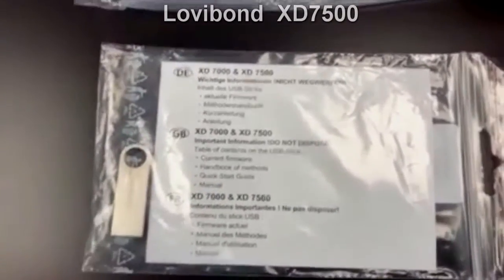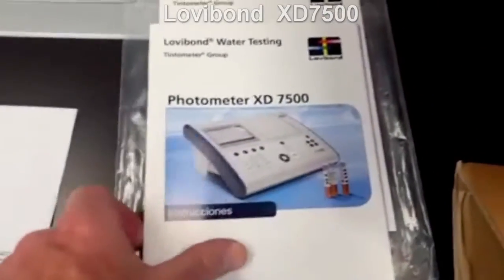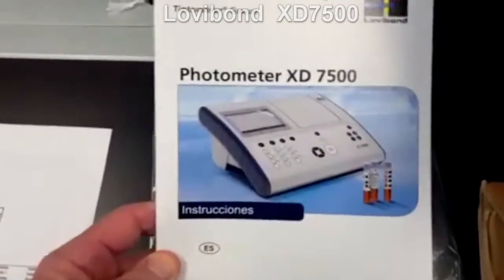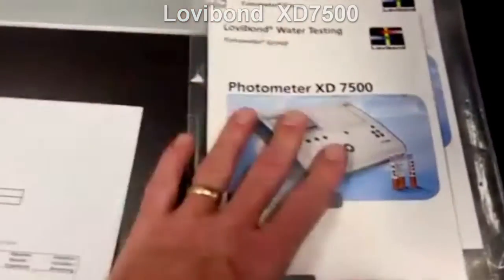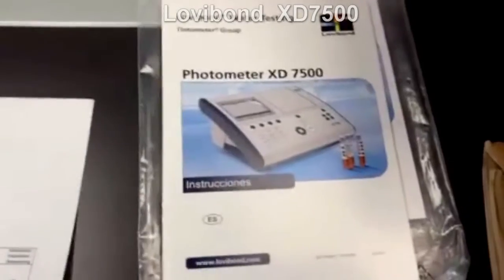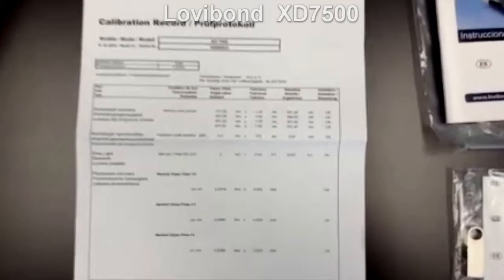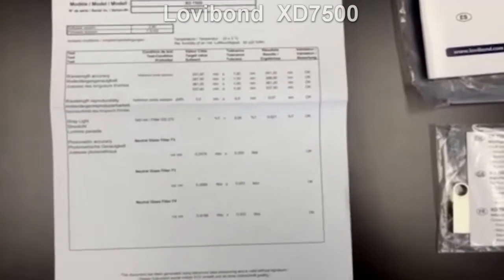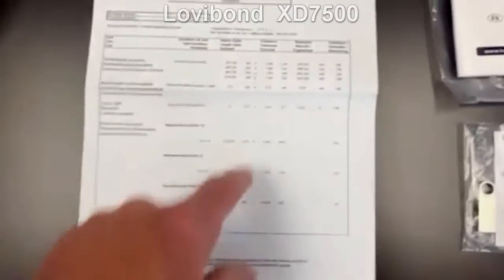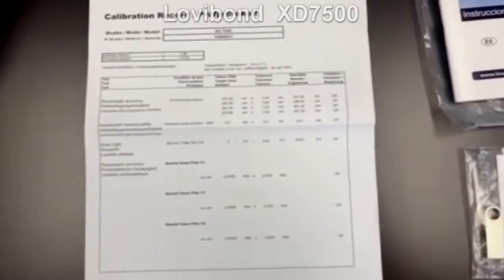We don't give you a full printed manual in the box, but you do get a quick start guide. Here's an example — this is the Spanish version, English version. You get a packet of all language versions. And then you get a certificate of calibration of the instrument from when it was first produced, so you get all the quality data to confirm the instrument was in specification when it was shipped.